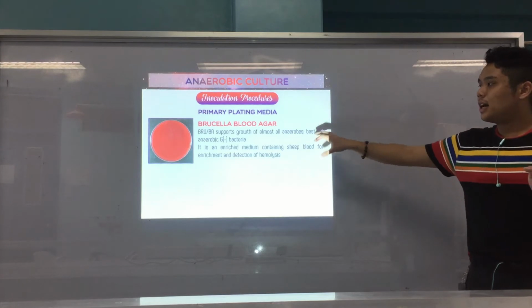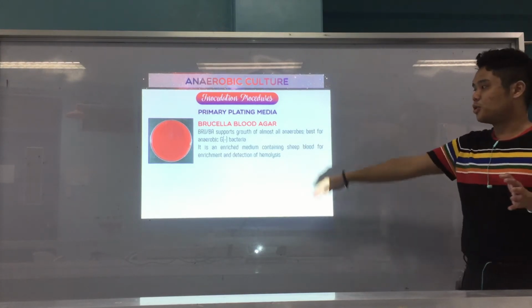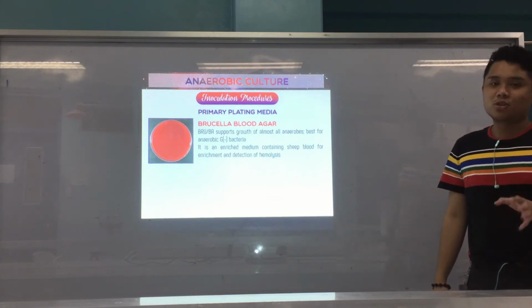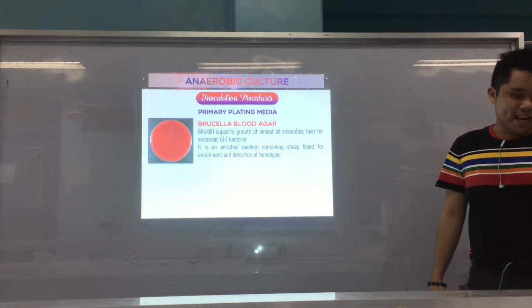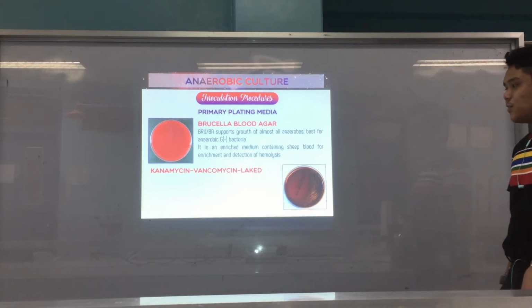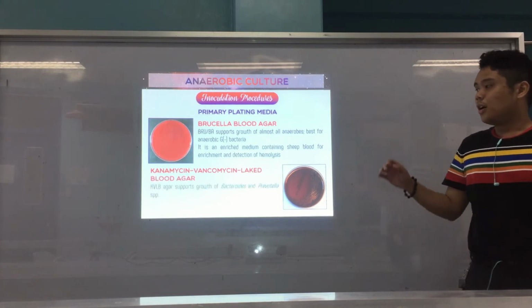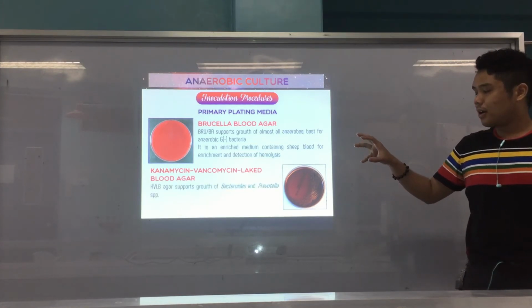Pero kani siya, I think there are some enrichment pud na gi-add aside from sheep blood. Okay? So that's the Brucella blood agar. Alright. Next, you have the kanamycin, vancomycin, laked blood, or KVL blood agar. So, what it does is, it's laked.